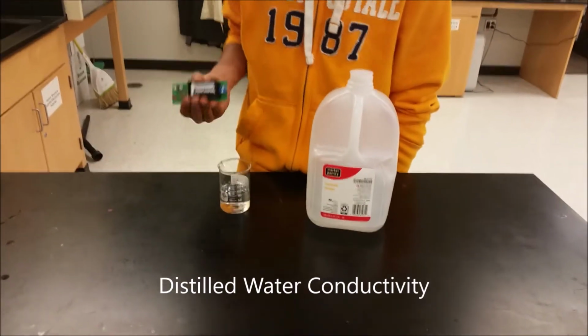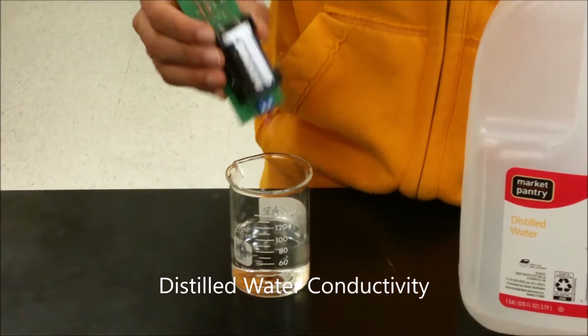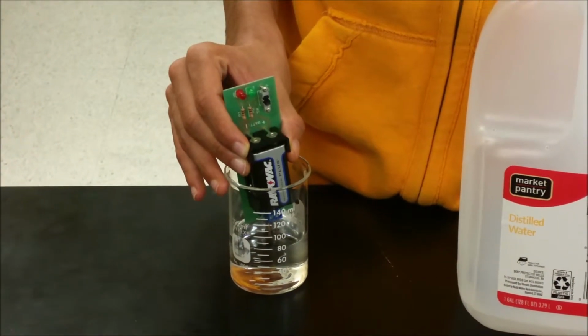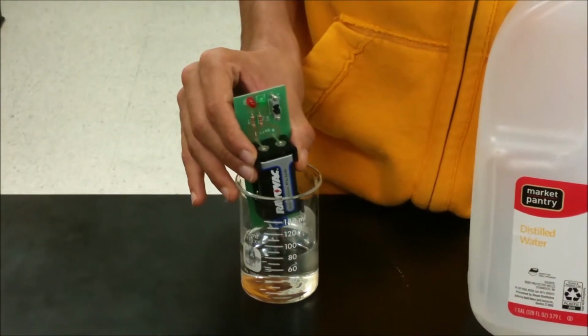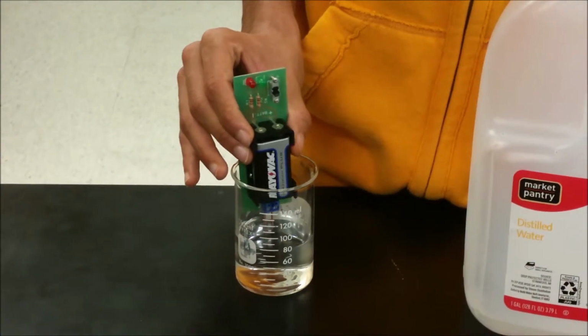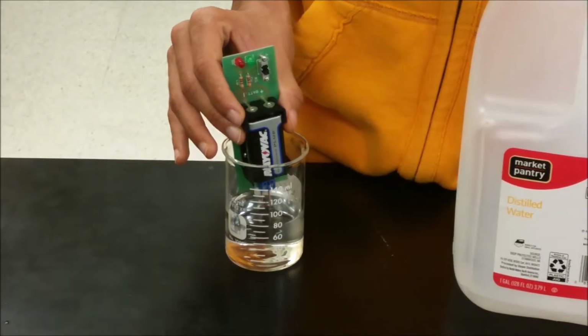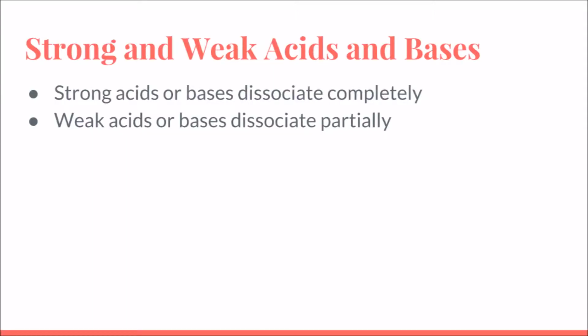This is distilled water, and we're going to test its conductivity with this probe and use it as a control. As you can see, neither the green nor red lights are lighting up, meaning that this water has very low conductivity. Strong acids and bases dissociate completely in solution, while weak acids and bases only dissociate partially.